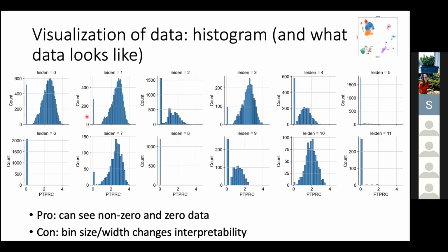Okay, the features I really want to point out here, because they're going to become extremely important, is you have a ton of zeros, and then you have something positive. Kind of looks Gaussian. I'd argue it looks more like a gamma distribution, but that is true for every single cluster. But each cluster has a different distribution. You see this cluster and this cluster, the distributions look kind of similar, but they're totally separate from this cluster. That's going to be important again later, as you move more through single cell.